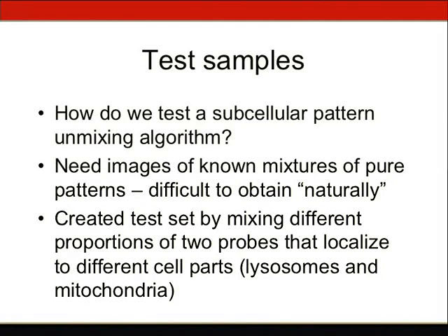Okay, now, here we come to the heart of things. Given this algorithm, how do we test whether or not this works? One of the ways we originally tested it was by making synthetic images, where we took known objects from known patterns and mixed them together in known proportions, and then tested to see whether it got the correct answer. The problem with that is that obviously it is going to work because we're using the same mixing model to generate the test data as we use for backing it out.